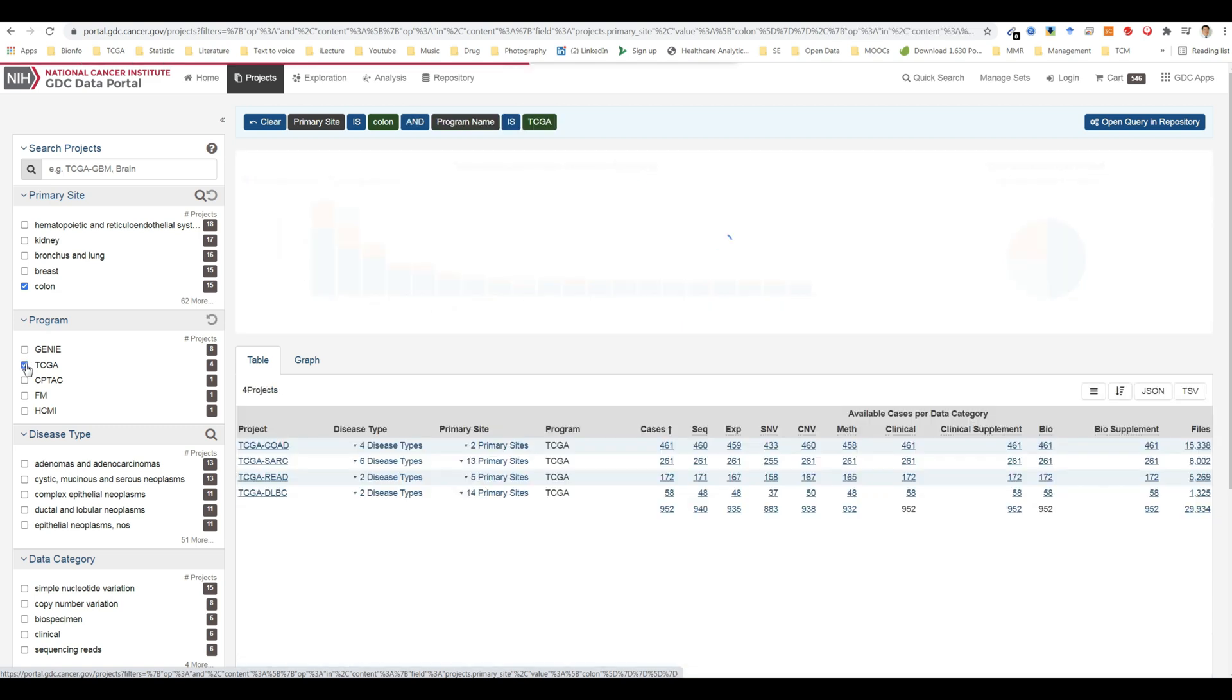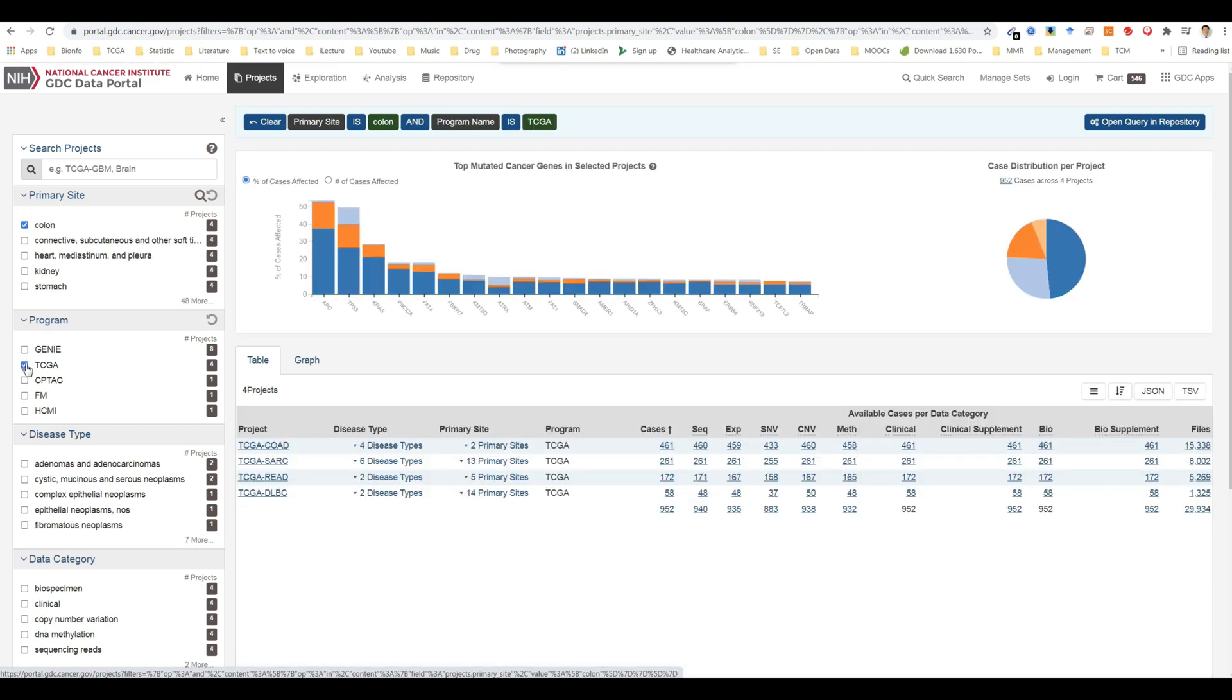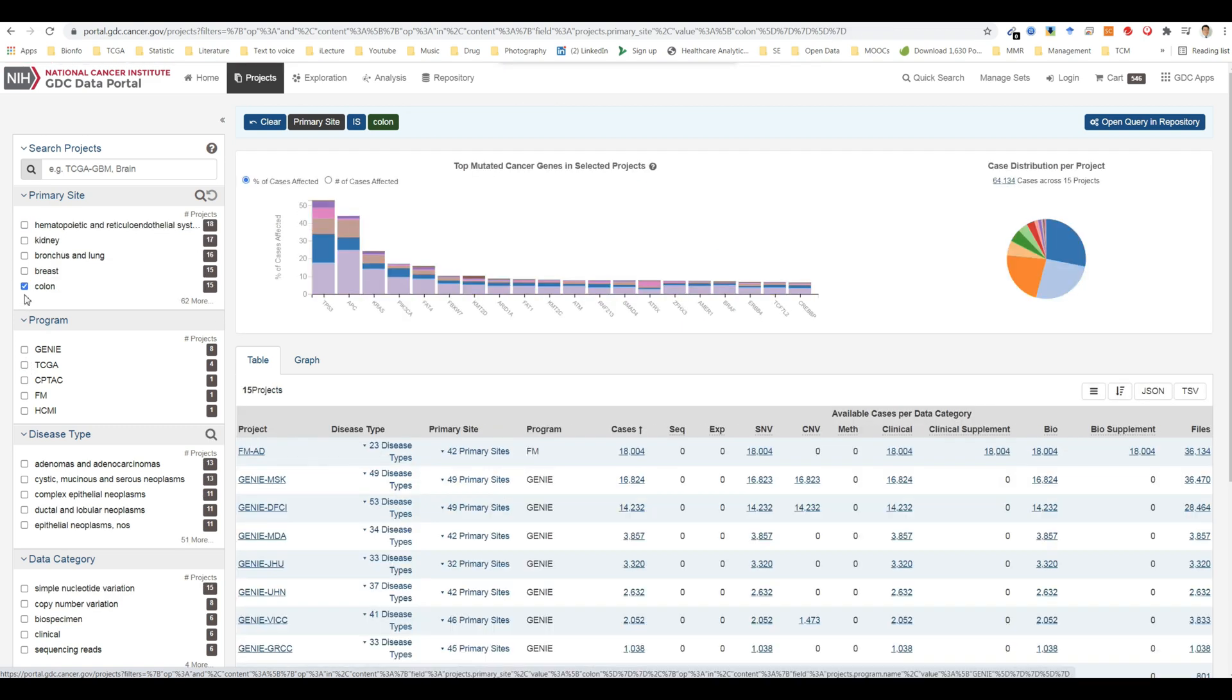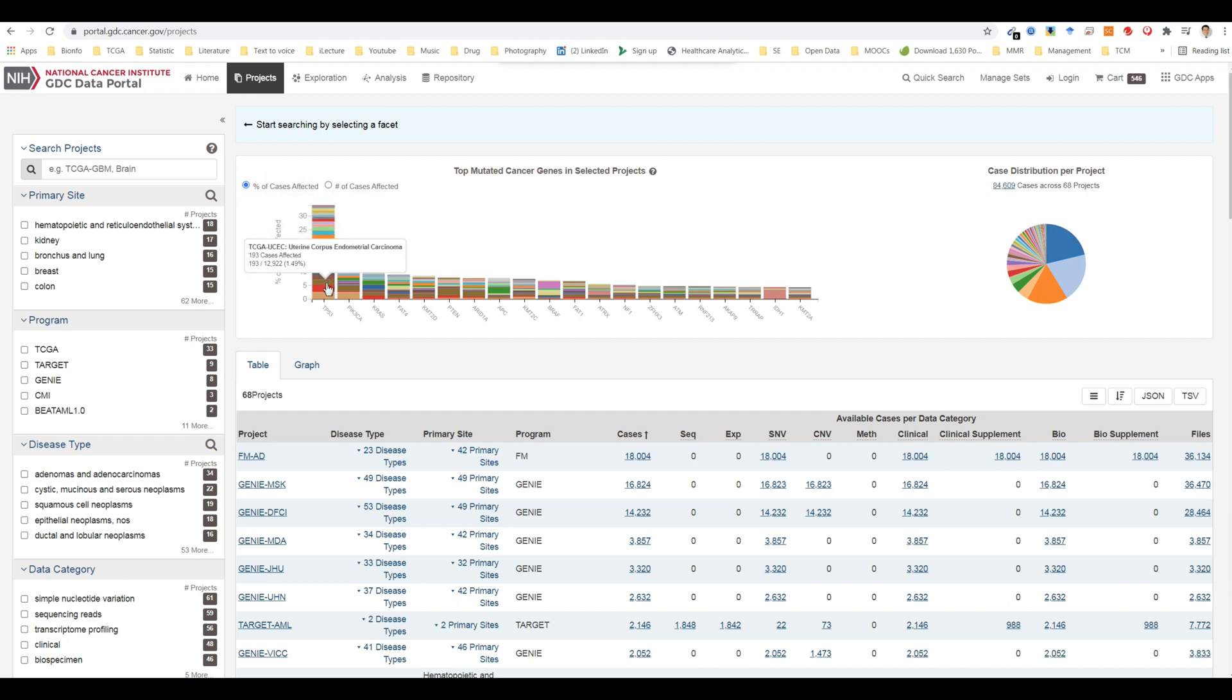The top right side of the projects page displays a few visualizations of the data, such as the top mutated genes in selected projects and case distribution per project. Hovering the cursor over each bar will display information about the number of cases affected by the disease type.